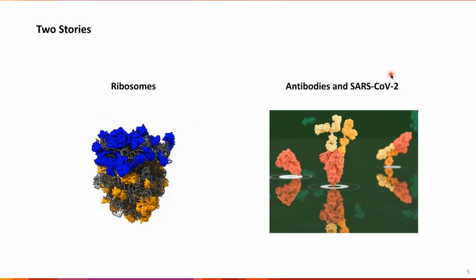So today I wanted to talk about two stories that were recently published by our group that are really on the sort of edge in terms of challenging systems. So these systems have historically been quite challenging, but today I kind of want to talk about our work studying them, as well as the title says, how single particle mass measurements have actually allowed us to probe systems and glean biological information that actually wasn't available to us before.